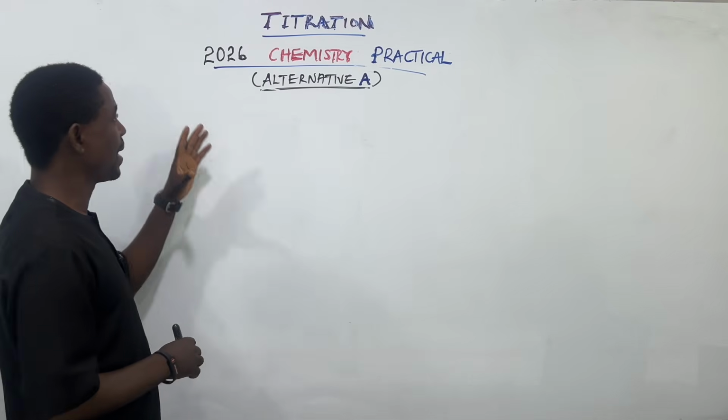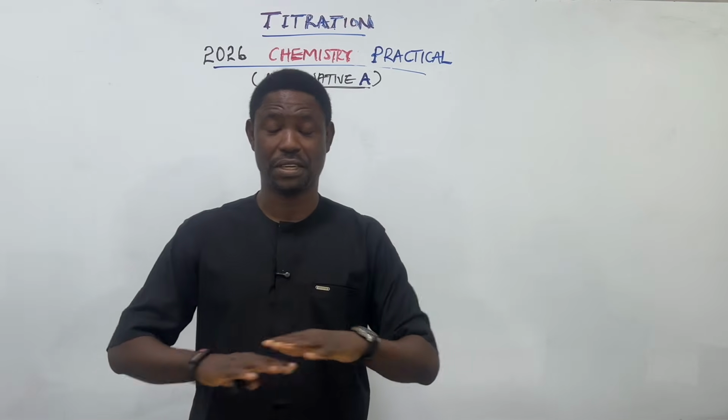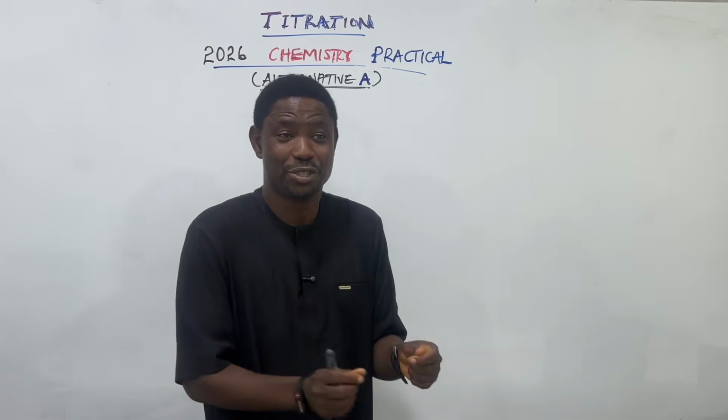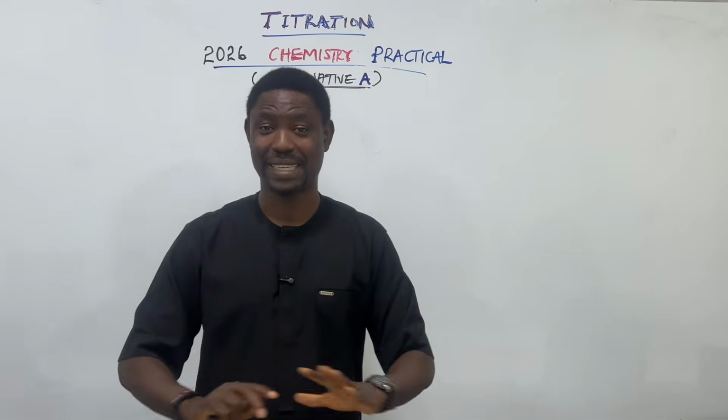The first thing I want to talk about is the titration. I want to believe that you know the titration procedures now. This is not the time you're just learning. You ought to have started since year 10, 11, 12, and you should be perfect at titrating now.